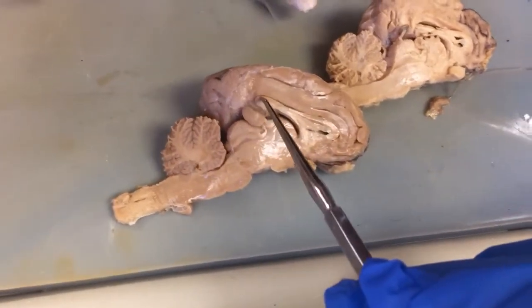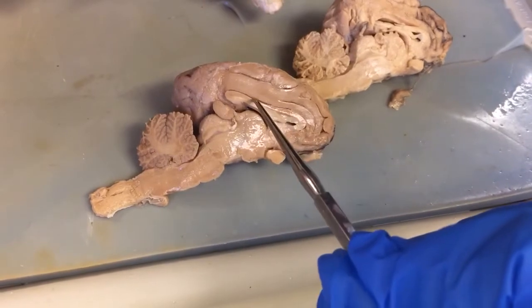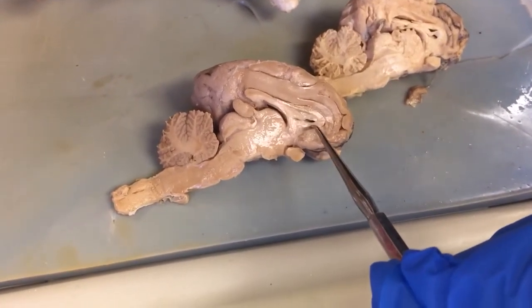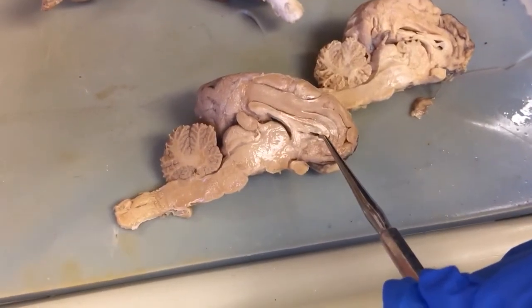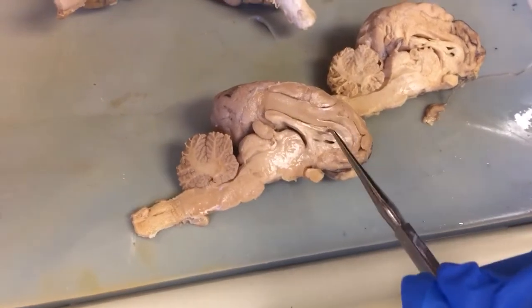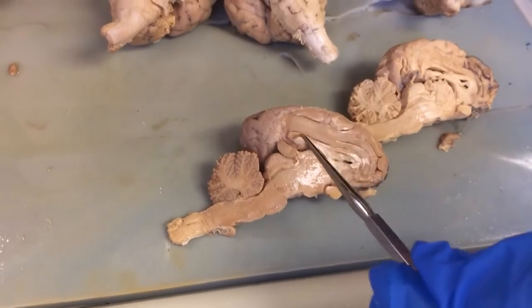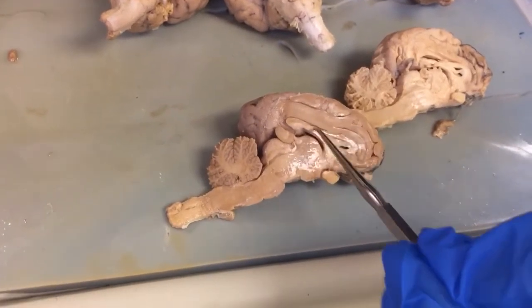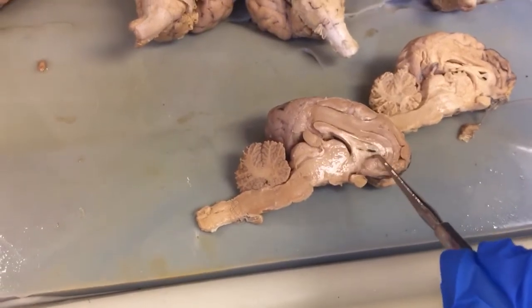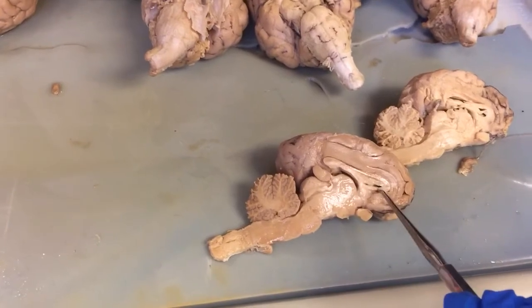The back part is the fornix. This long skinny connection is the trunk. And then this part down here, what is that called? That's the fornix. Wait, you said the top part is the fornix? Oh, sorry, this part is the splenium. Sorry, the front part is the genu, the back part is the splenium. So we've got genu and splenium, and then the long part connecting is the trunk. And then the part that wraps around more ventrally by the genu is the fornix, okay?